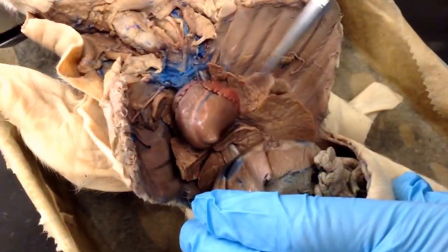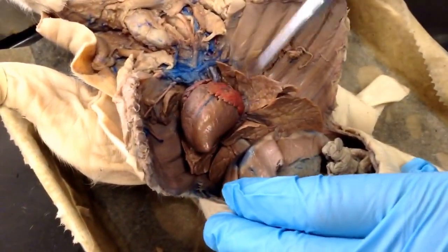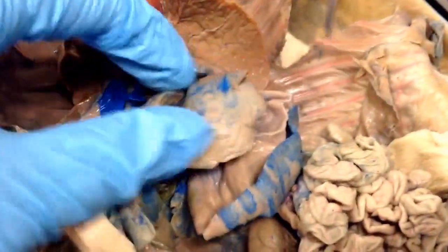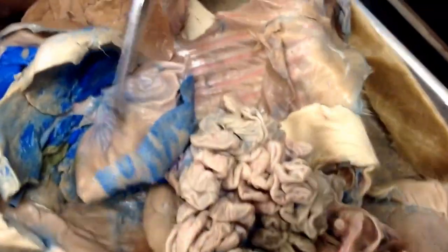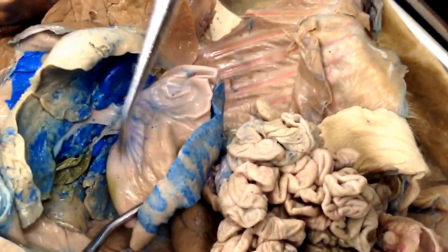Lung tissue, more lung tissue, the diaphragm muscle, and the heart. There, that's still the diaphragm muscle, but if you pull that up and reflect that up, this is the liver. So then under the liver, you want to do the stomach?